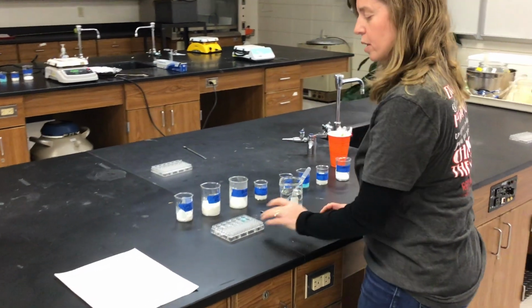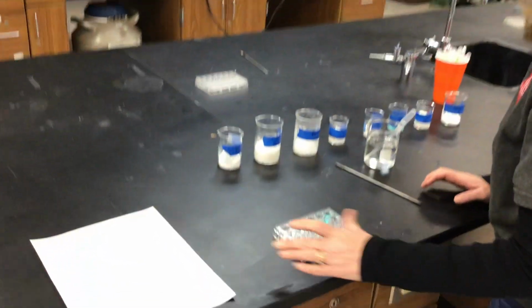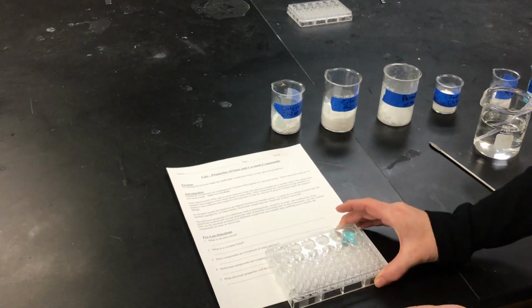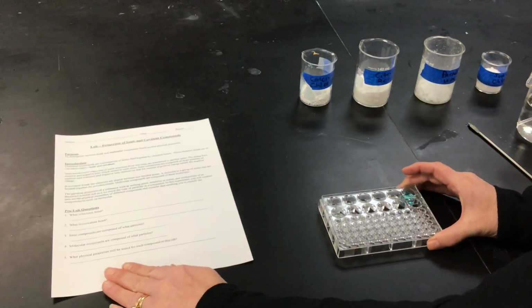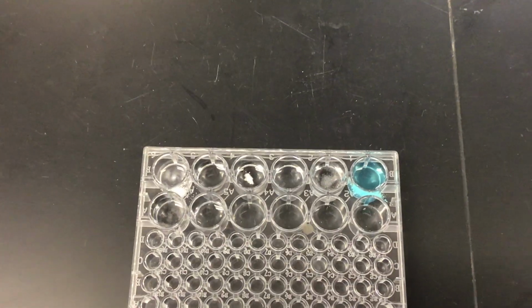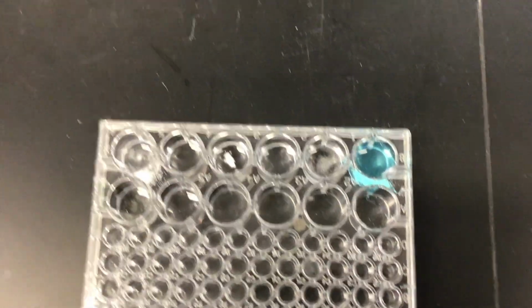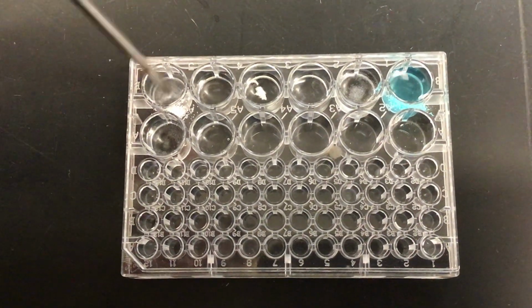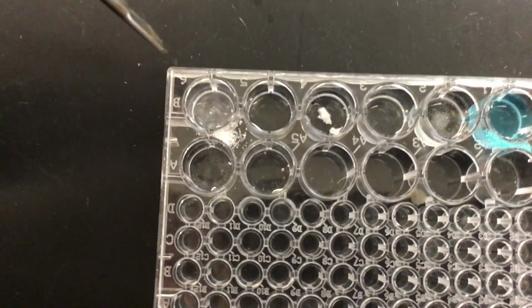So now Miss Bunch is going to come over here and she's going to zoom in. Now, as you can see, number 1 pretty much dissolved.